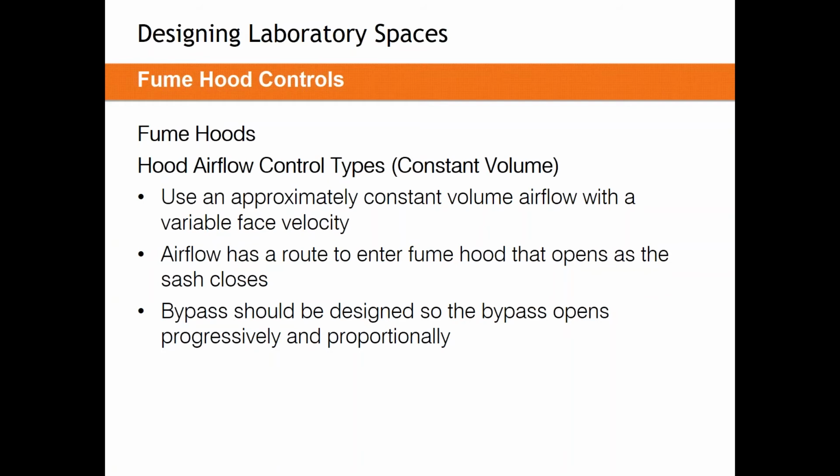The example I like to use is in a lab that's driven by ventilation rate or by thermal demand. Constant volume fume hoods can be well applied. So what I'm getting at here is if your minimum air change rate or your thermal demand require that you have, say, 1,000 CFM of exhaust. If your fume hoods take up only a portion of that, say 500 CFM, then constant volume fume hoods are a perfectly applied product. Basically, in any application where you do not inflate your makeup air numbers, you can and should use constant volume fume hoods.